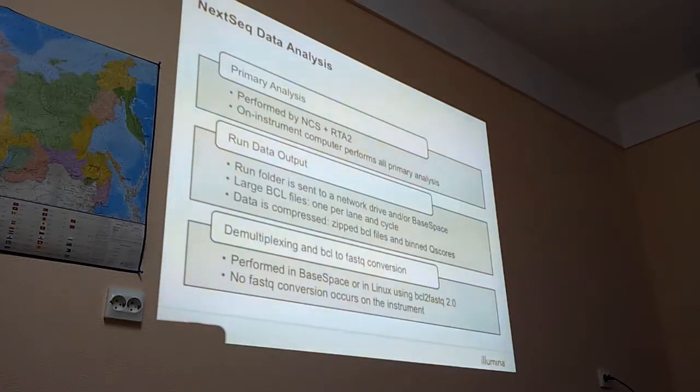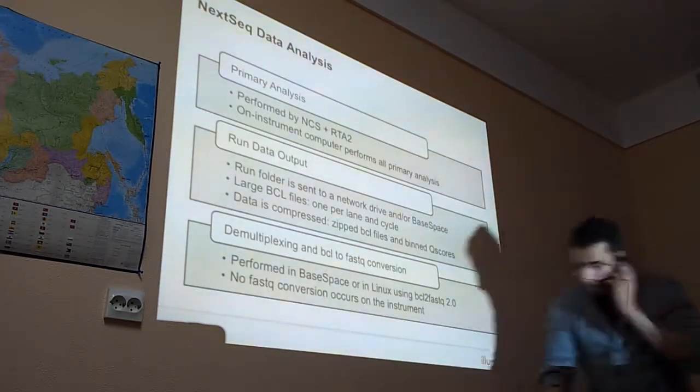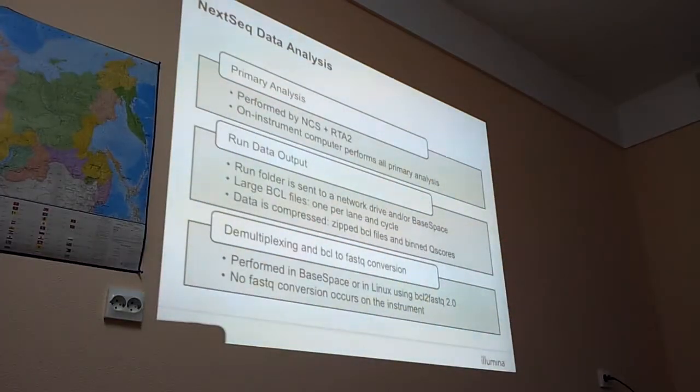You need a Linux system for this. Red Hat or CentOS? Red Hat, yes. I think most people use Red Hat. I think both are possible. So this is different to MiSeq. With MiSeq you get the FastQ immediately. You have no such program for NextSeq.